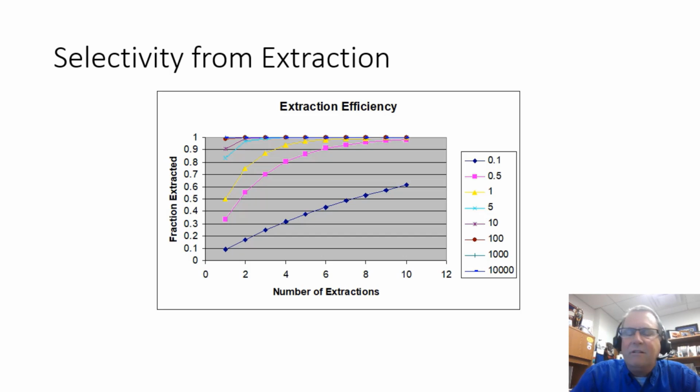How do I handle the fact that I don't extract as much? Maybe I'll use a more sensitive detector or a larger volume injection or something like that with my gas chromatograph. But we can really get in there and think about the chemistry to help us green our methods, to help them be more efficient. At the end of the day, for those of you in business and industry, to help you save money. And you can get green. I think you can be green, be efficient, and save money all at the same time when we're thinking about sample prep and when we're thinking about GC.